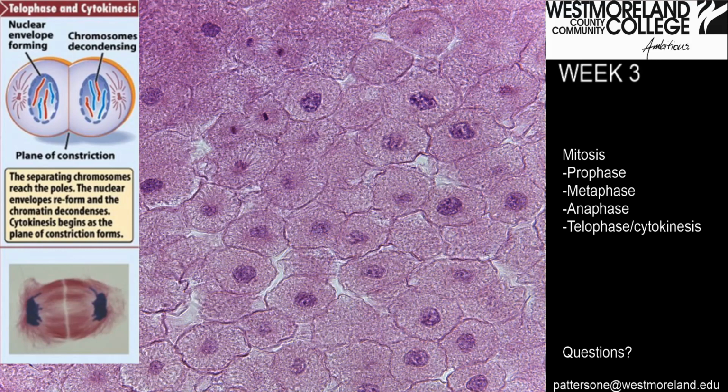So looking at this fish slide, are you able to find the cell that has the cleavage furrow, where the chromosomes are just barely connected through the opening that is left? This cell that will soon become two cells is in telophase. We can see the nuclei still appear just to be connected through the middle of that cell. But whenever I remove the circle again and you follow the cell membrane, there's an obvious indentation between those two cells where those nuclei are connected, and that is the cleavage furrow.